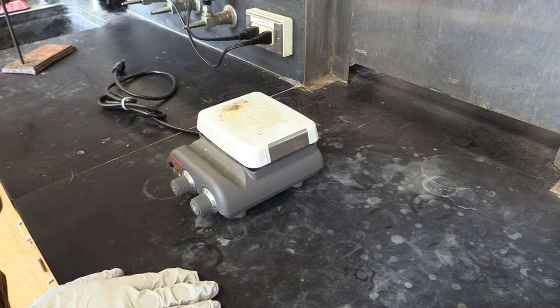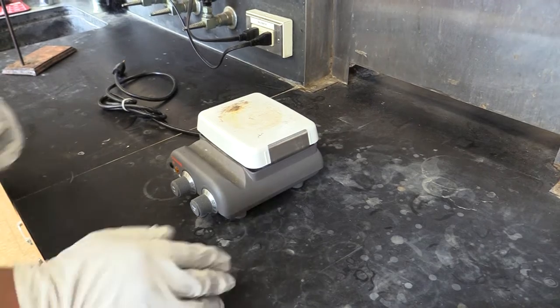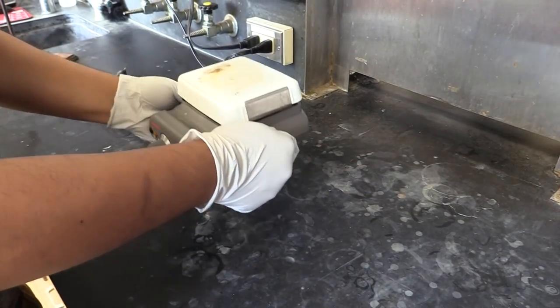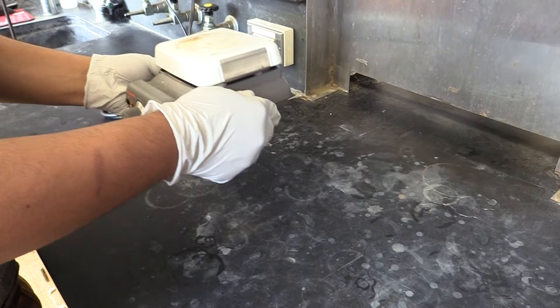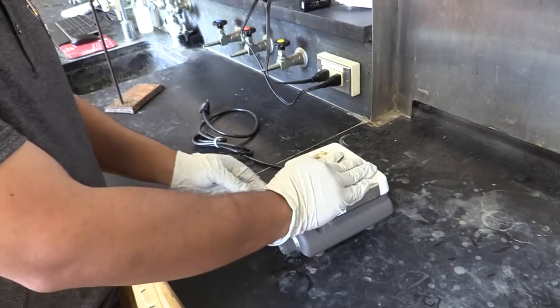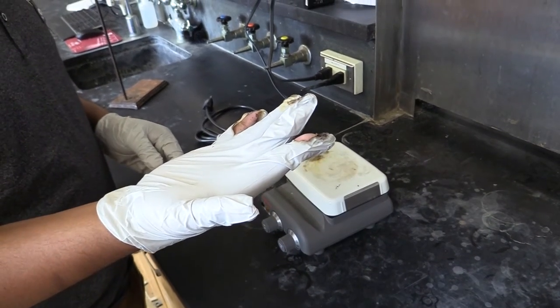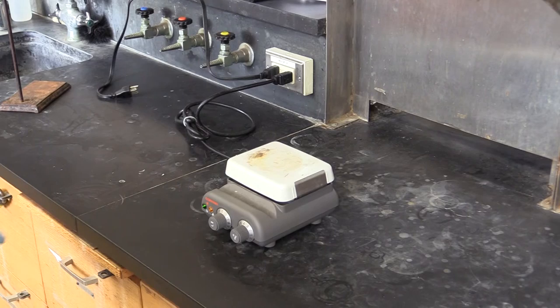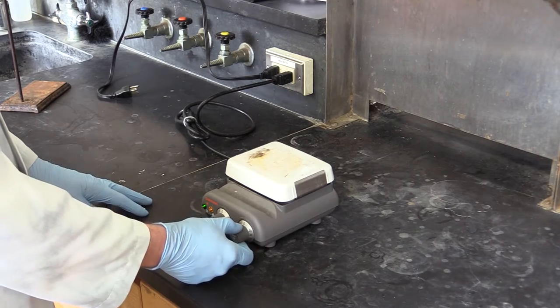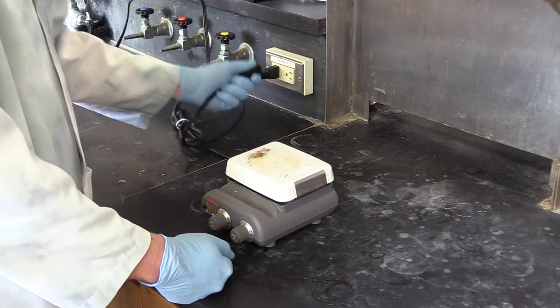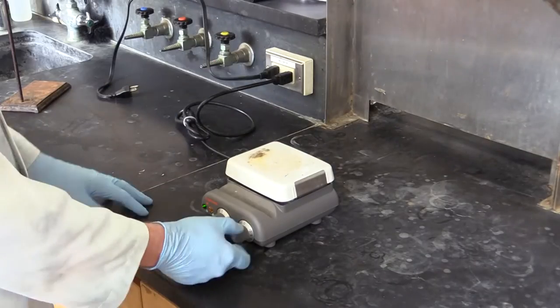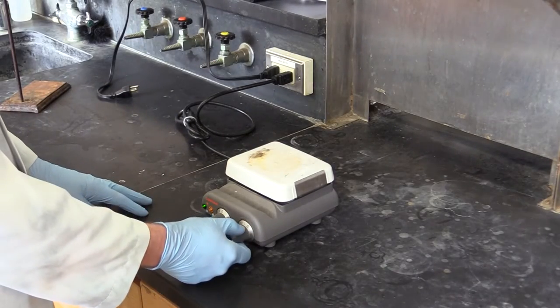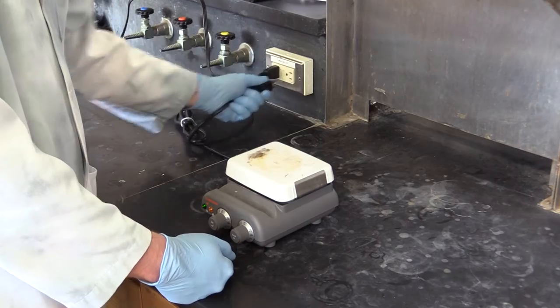Some of your experiments will involve hot plates. When you go to move these around, make sure to grab them by their base and not the top. If somebody else was just using the plate at your station, it may still be hot from using it. And if you touch the top, you're going to burn yourself. When you're done using your hot plate, make sure you turn it off and unplug it at the end of the day. If you don't, you may get a point penalty on your lab report.